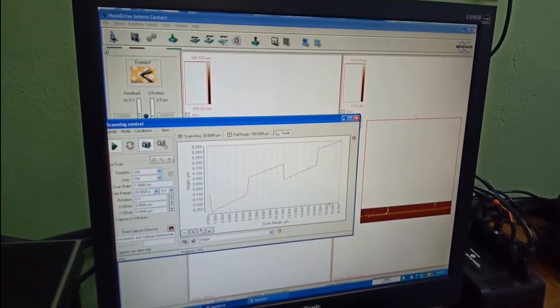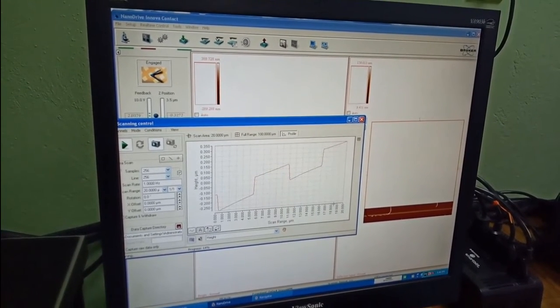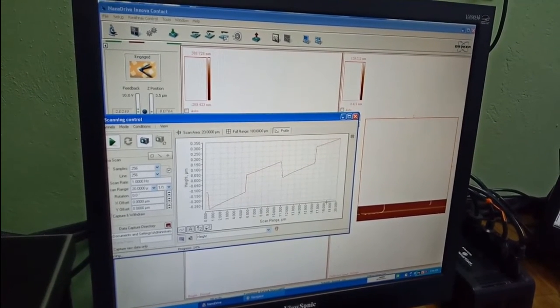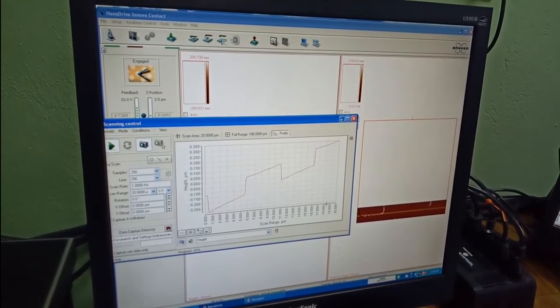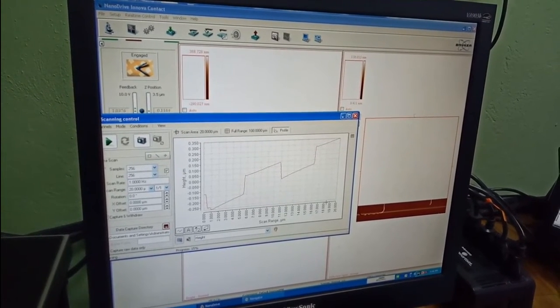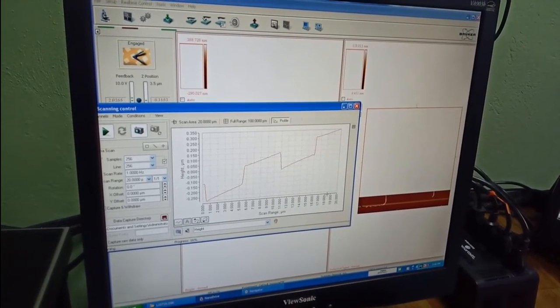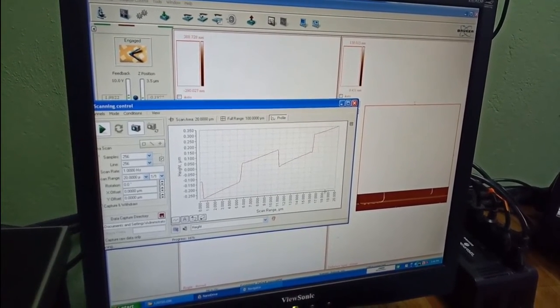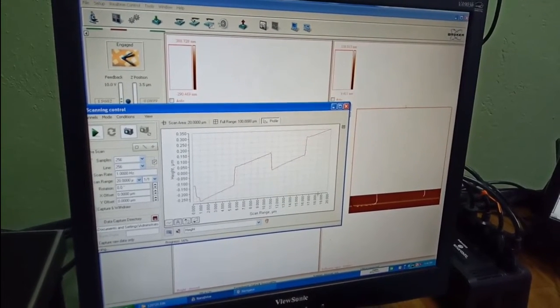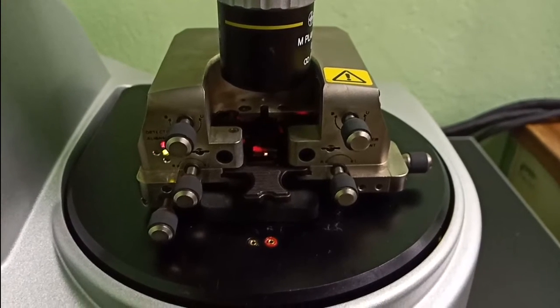In this part, you can observe that our topography has holes, like a very small pool. These pools are around 5 micrometers, but we can observe less than that, in the nano scale, because we are already using an image size of 20 micrometers.